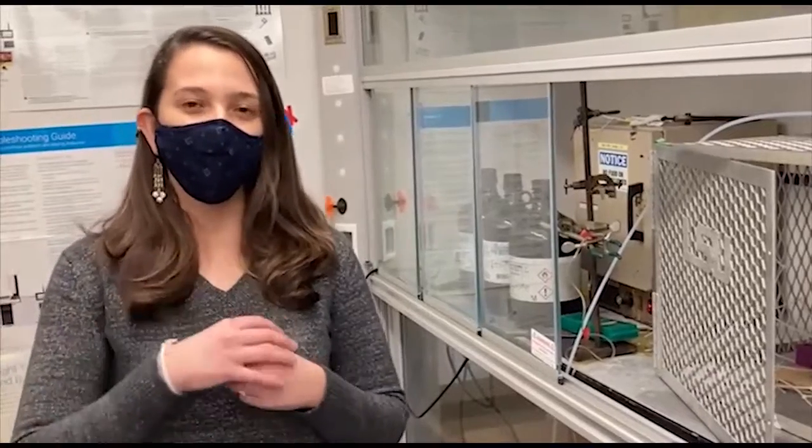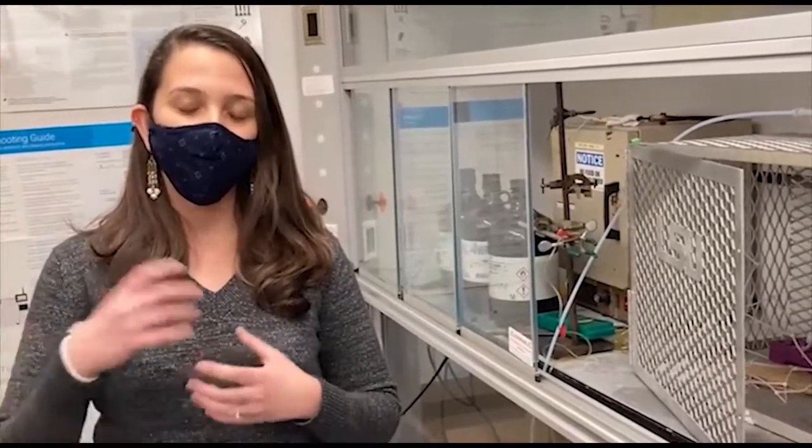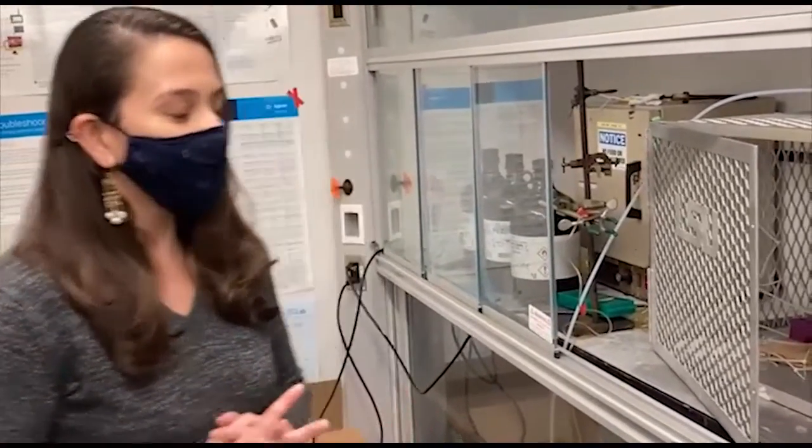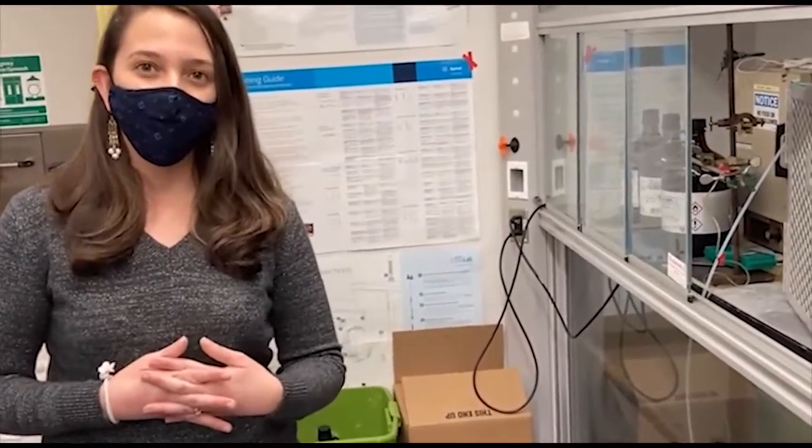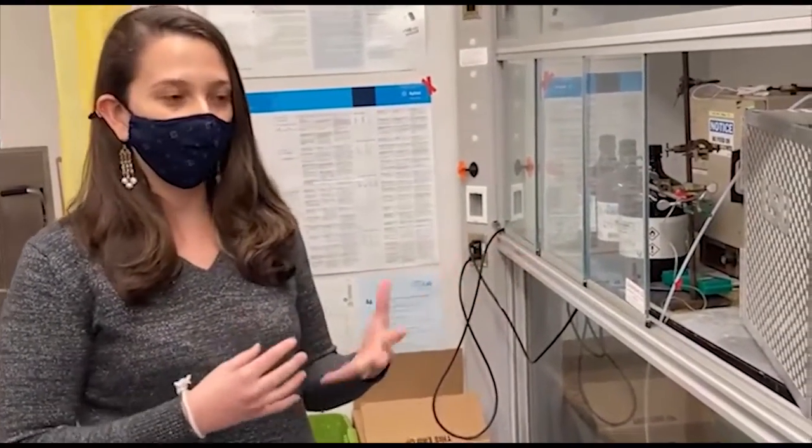So that heat that's generated on the surface of the nanoparticles under an applied magnetic field can be easily transferred to a catalytic process, for example, where the reactants are going to use that energy to convert the material into a usable product. So that's one aspect of my research. We've also been trying to manipulate size and morphology of nanoparticles to make that heat generation process more efficient.